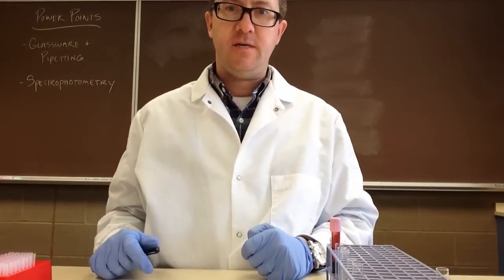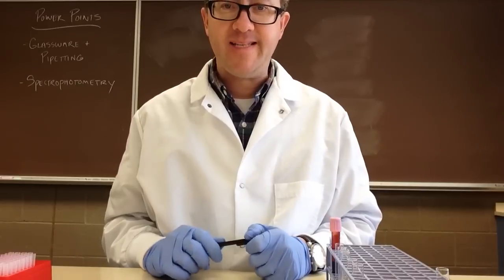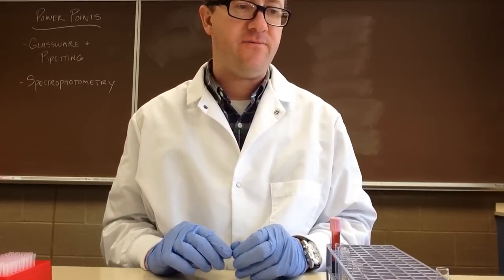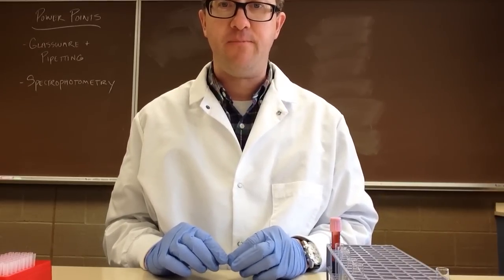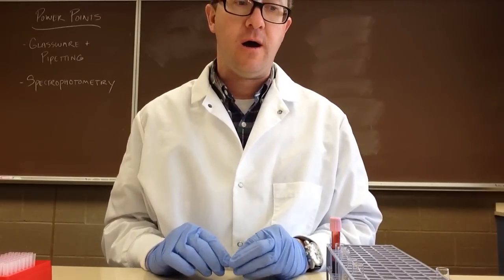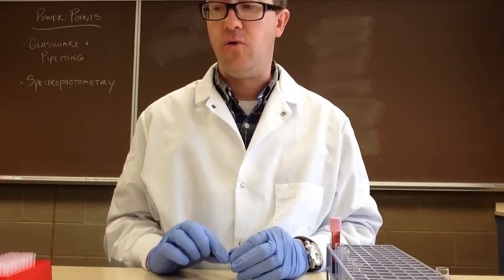In this video, we are going to take a look at micropipettes and do a little bit of micropipetting. We're going to look at four different micropipetting techniques: forward, reverse, repetitive, and whole blood.